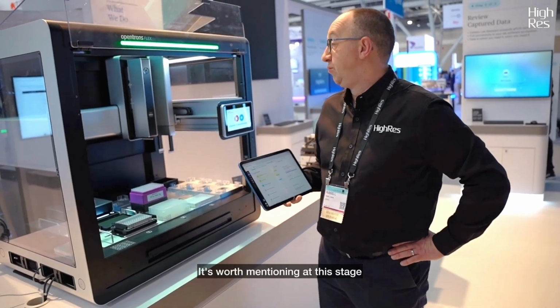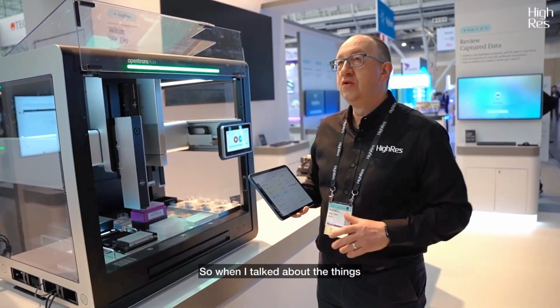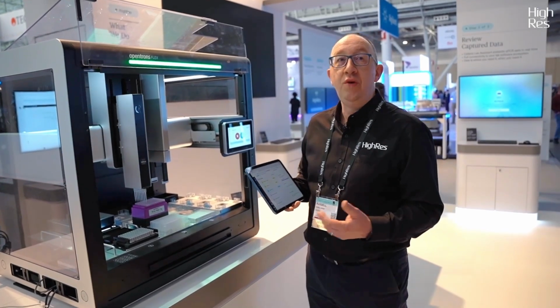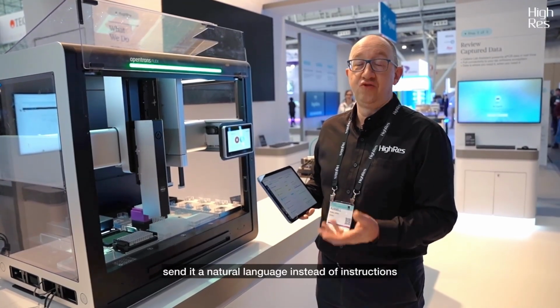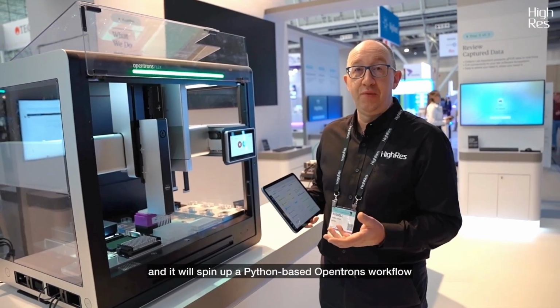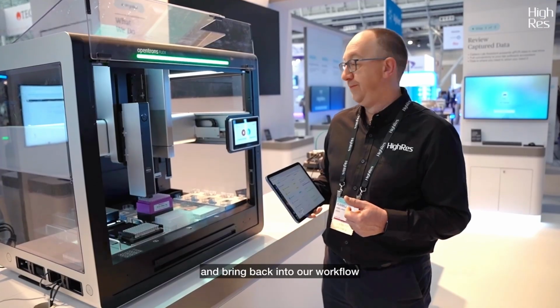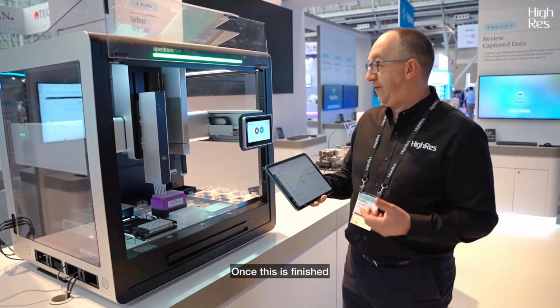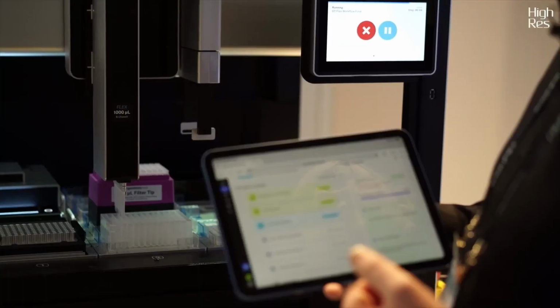It's worth mentioning at this stage, while we're thinking about the OpenTrons, that we also have a collaboration with OpenTrons. So when I talked about the things that Lab Assistant can do in terms of creation of workflows and creation of protocols, we can extend that even further, communicate directly with OpenTrons' own AI, and send it a natural language set of instructions on the method for the liquid handling that I want to do, and it'll spin up a Python-based OpenTrons workflow, which we can then capture and bring back into our workflow. So we've got this full integration with their own AI-driven workflow building. Once this is finished, we're then going to go into the next guided step and take it over to the Precise Drop.